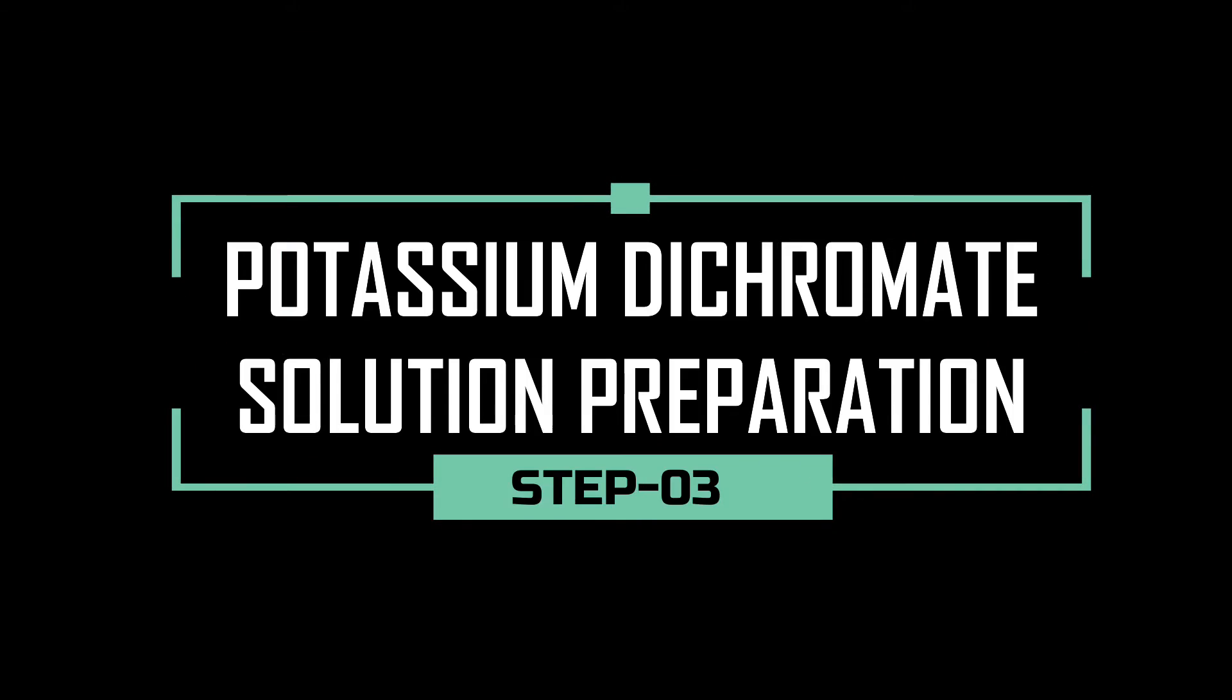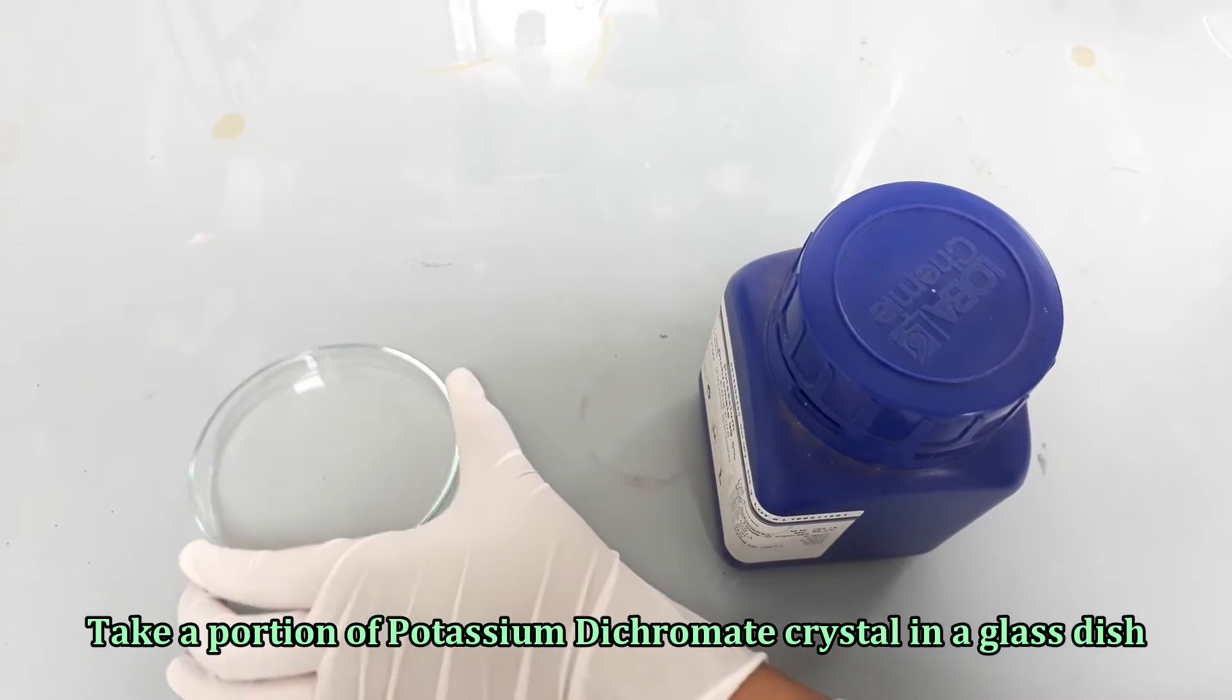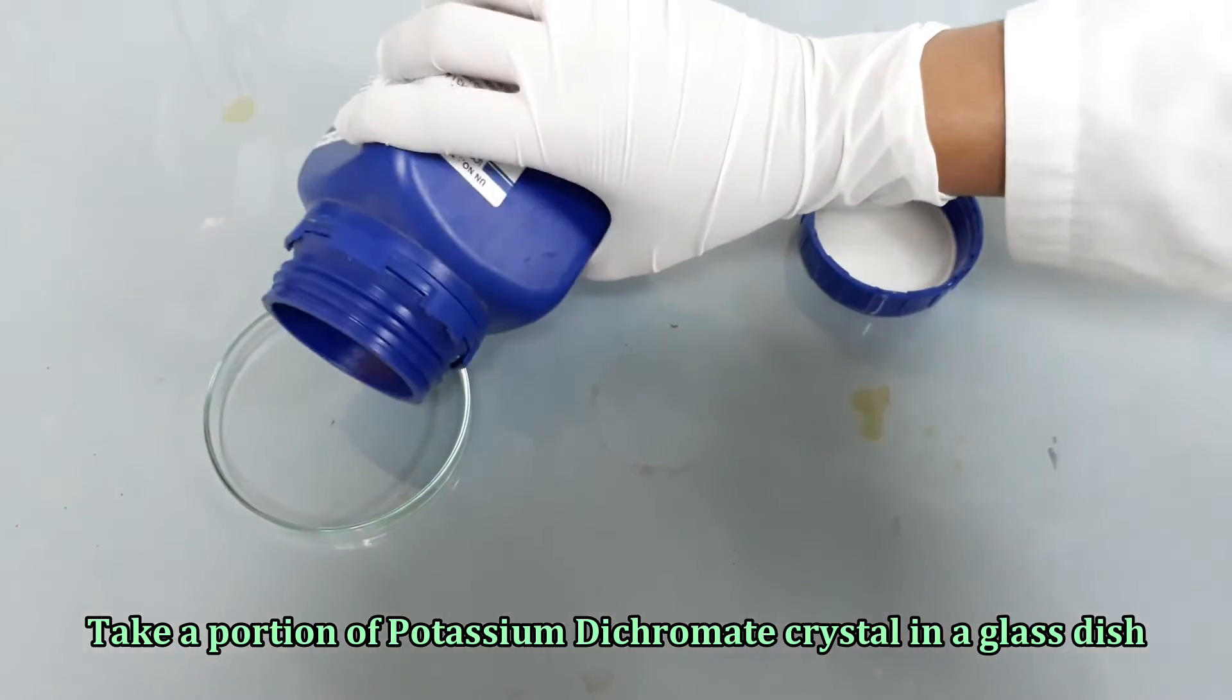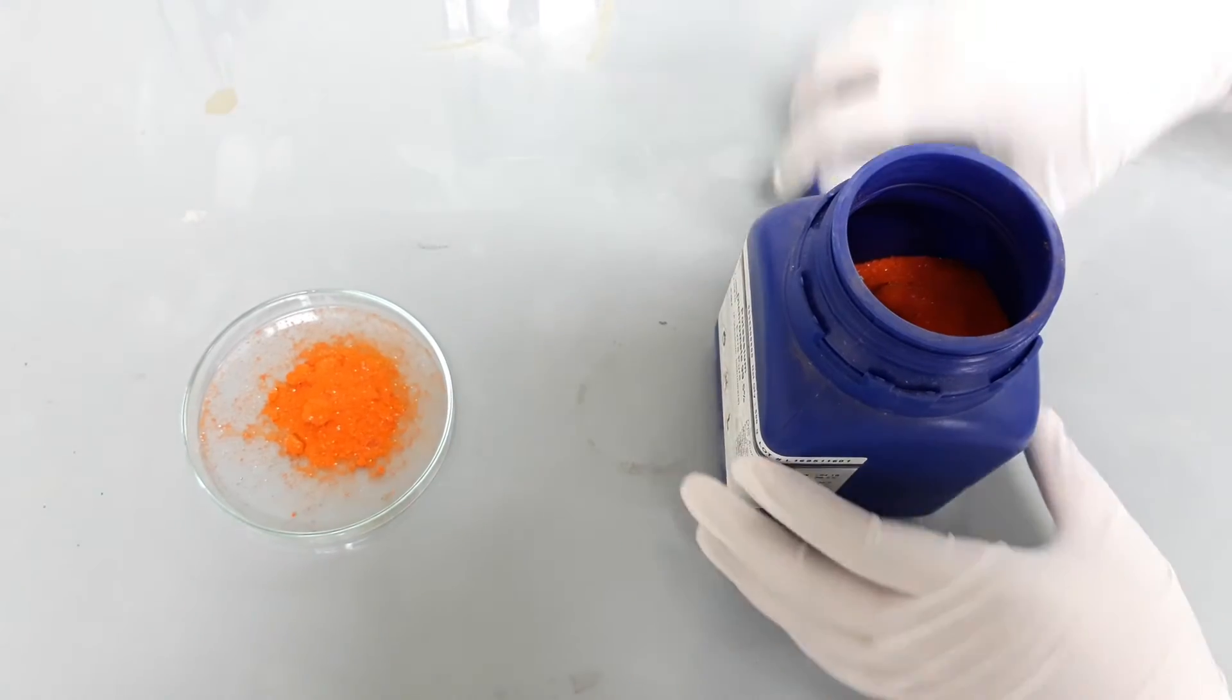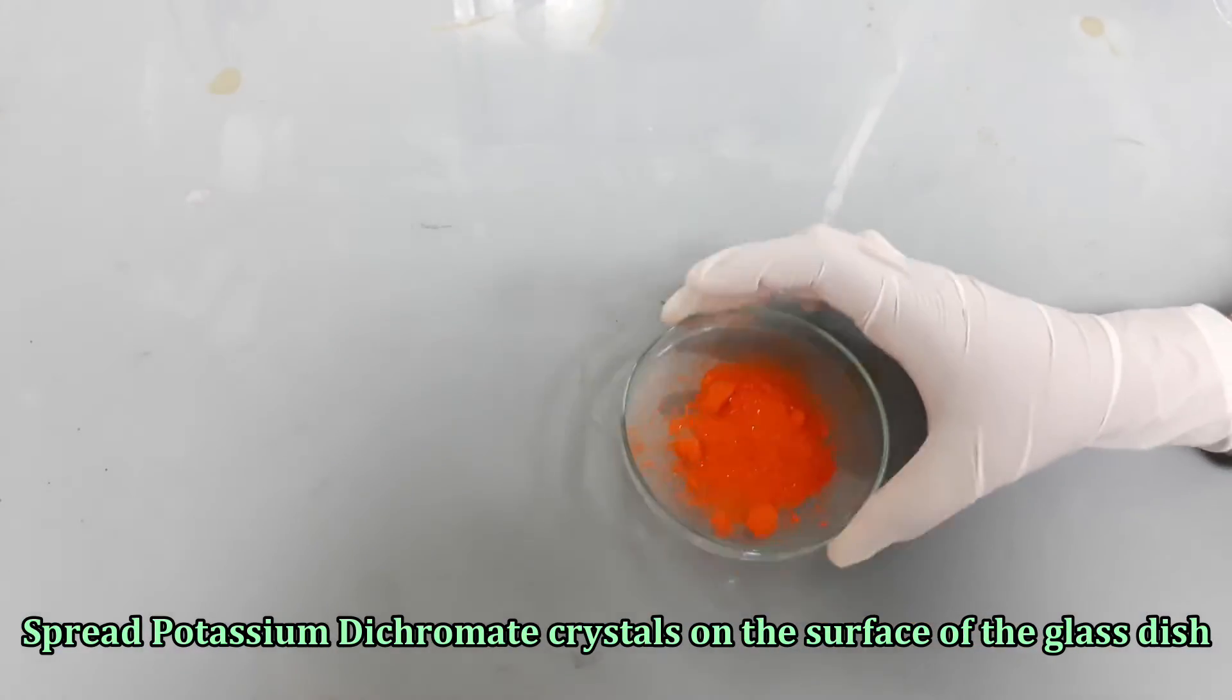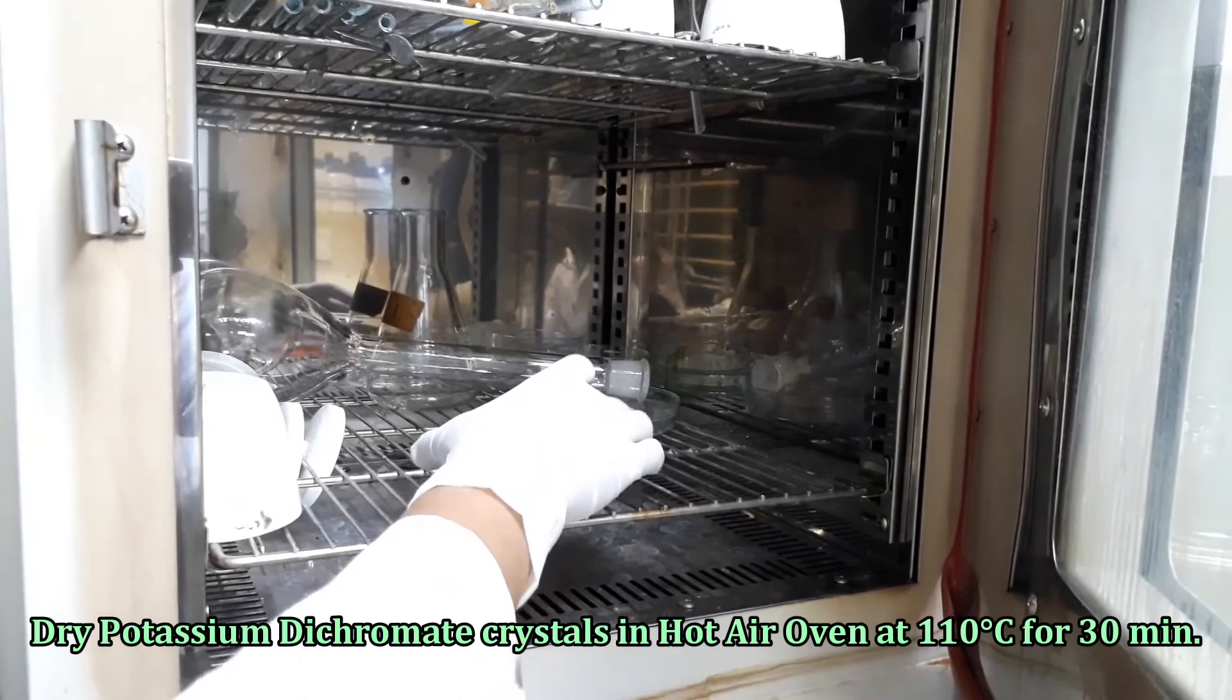Now, we will prepare potassium dichromate solution. Take a portion of potassium dichromate crystal in a glass dish. Dry the potassium dichromate crystals at 110 degrees Celsius for 30 minutes.